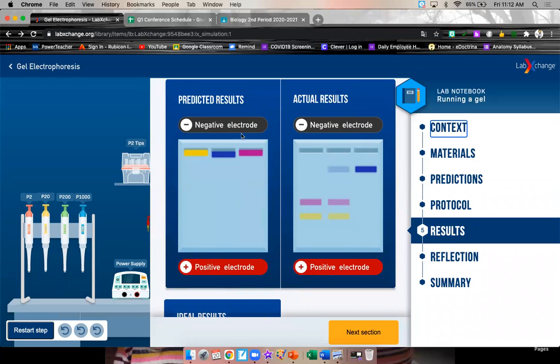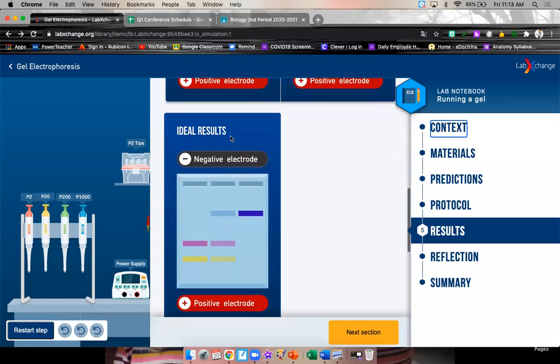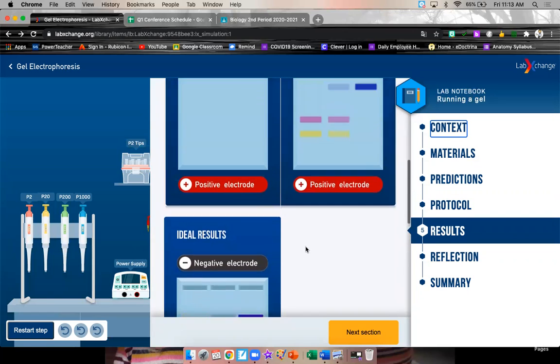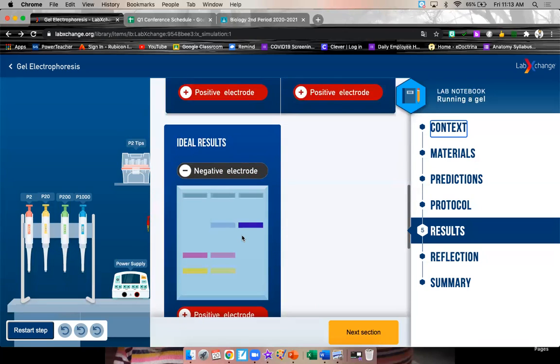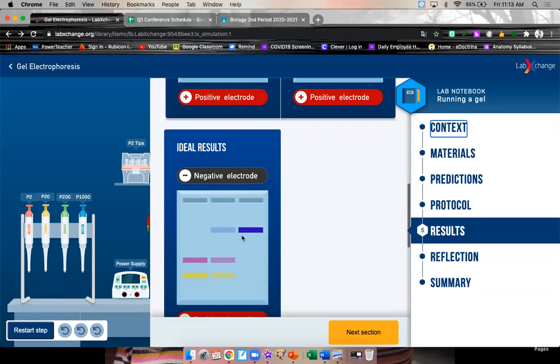So, this was the predicted results. I did not do one. That is up to you. This is the results you actually got. So, this was the experiment. This was your prediction. This was your experiment. And this is what you should have gotten. So, as long as you did it right, it should look like this. And we are looking pretty good.